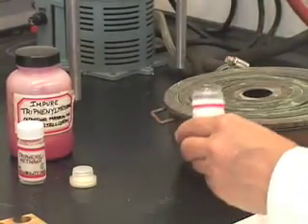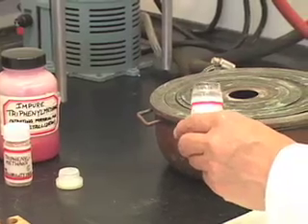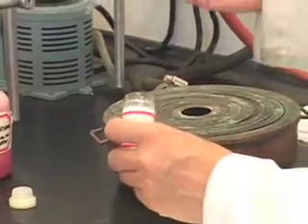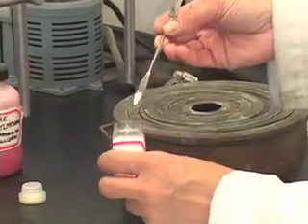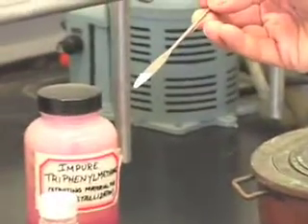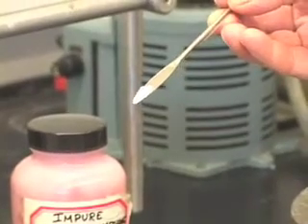How much of the solid should you be taking? You want to take about a tip full of the spatula of the solid that you are using.